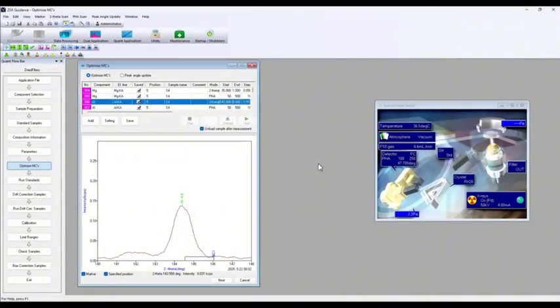Okay, so today we're going to talk about a tool called Analytical Precision Evaluation. This is a really neat tool. In some softwares, you may find that you can't know exactly what your detection limit is going to be until you've generated and run all your standards, generated calibrations, only to find out maybe I didn't count enough time for aluminum, let's say, and I need to go back and redo that application with a longer time for aluminum. Or I want to know what's my limitation. Well, the nice thing with this ZSX software is it's all built into the application of a quant method.